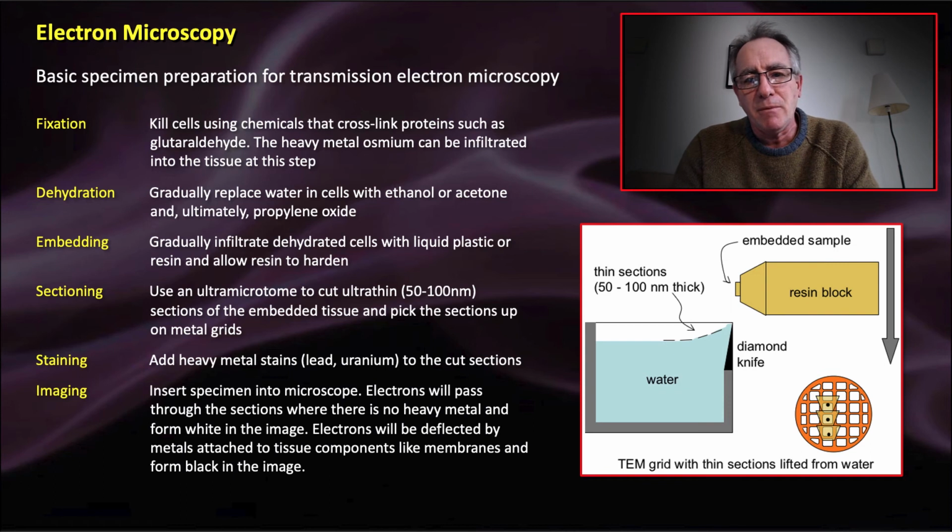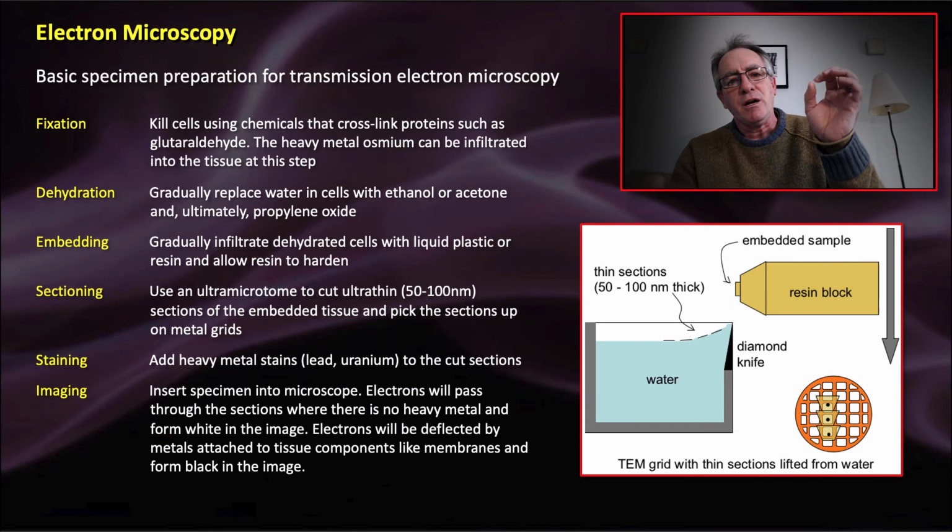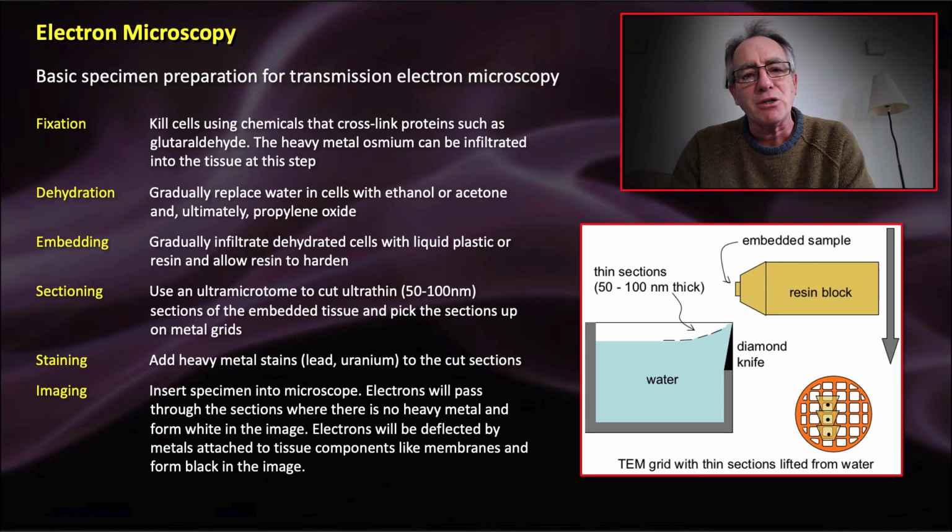With electron microscopy, it's not easy to teach it as part of a single practical in a module. We do, though, in most years when we can get in and get our hands on the microscope, unlike in this COVID year, we do get you in. We have samples that are pre-prepared, so at least we let you run the microscope and make images of cells. Anyway, that's skipping over a lot of the steps that are indicated here.